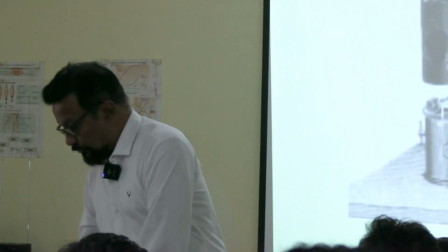Through it, you can decide to send a stimulus to the nerve once at a time, only one single stimulus, or you can make repeated stimuli.